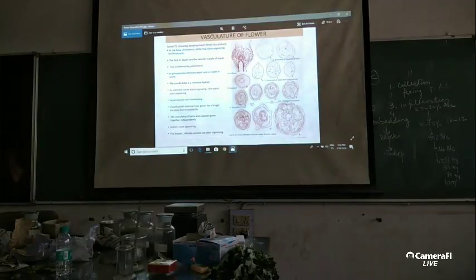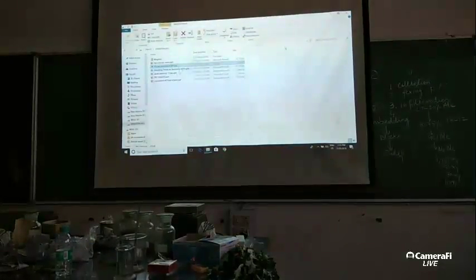You keep on cutting the sections, and ultimately you can see the vascular traces which are there. You can also see all the 5 stamens which have got opened up, but you can see that everywhere the microsporangia are not as yet clear. They are under formation. So this I wanted to just show you, this is how we can use. These are all camera lucida drawings. These drawings are camera lucida drawings. So this is true to the cell size. Because I wanted to make a line diagram, I have made a line diagram.